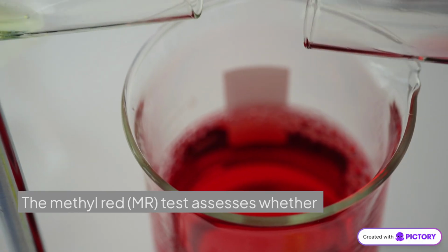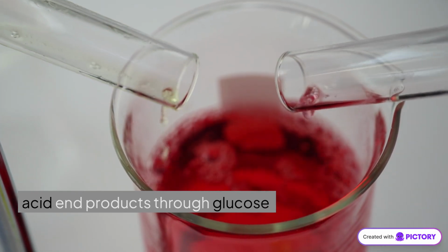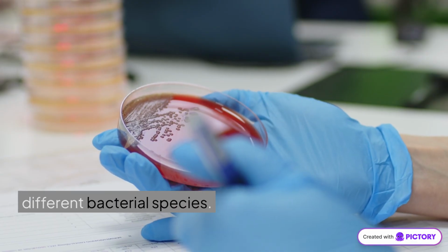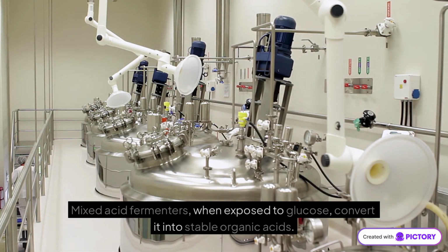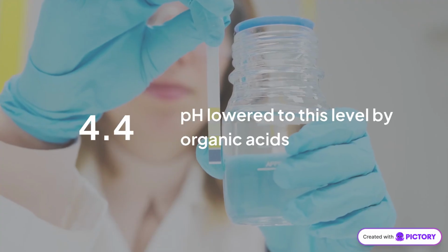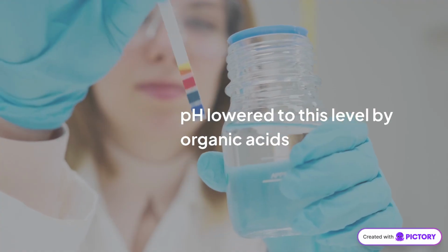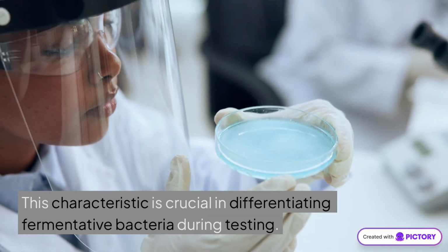The methyl red (MR) test assesses whether an organism produces highly stable organic acid end products through glucose fermentation. This capability is significant for understanding the metabolic processes of different bacterial species. Mixed acid fermenters, when exposed to glucose, convert it into stable organic acids. These acids include lactic acid, acetic acid, and succinic acid, permanently lowering the pH to 4.4 or lower. This characteristic is crucial in differentiating fermentative bacteria during testing.